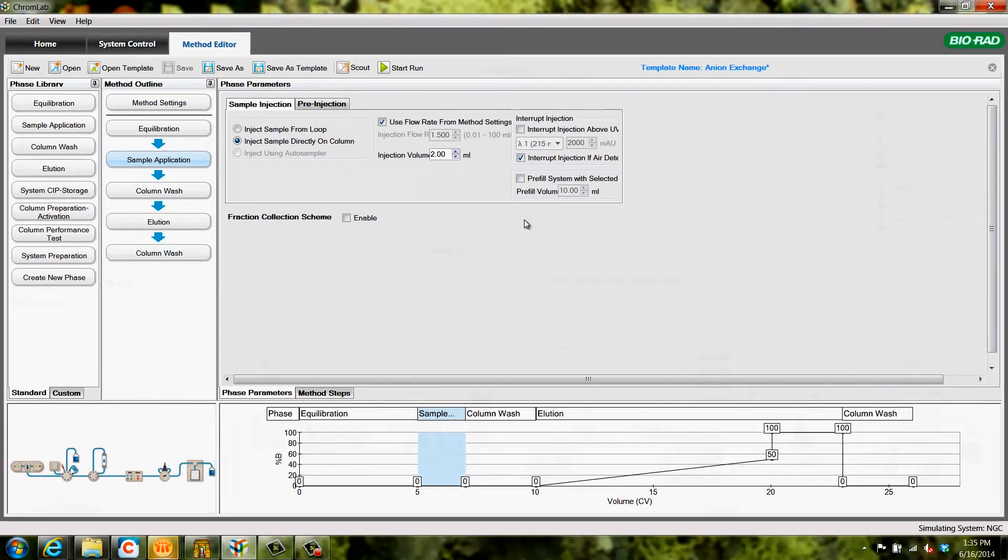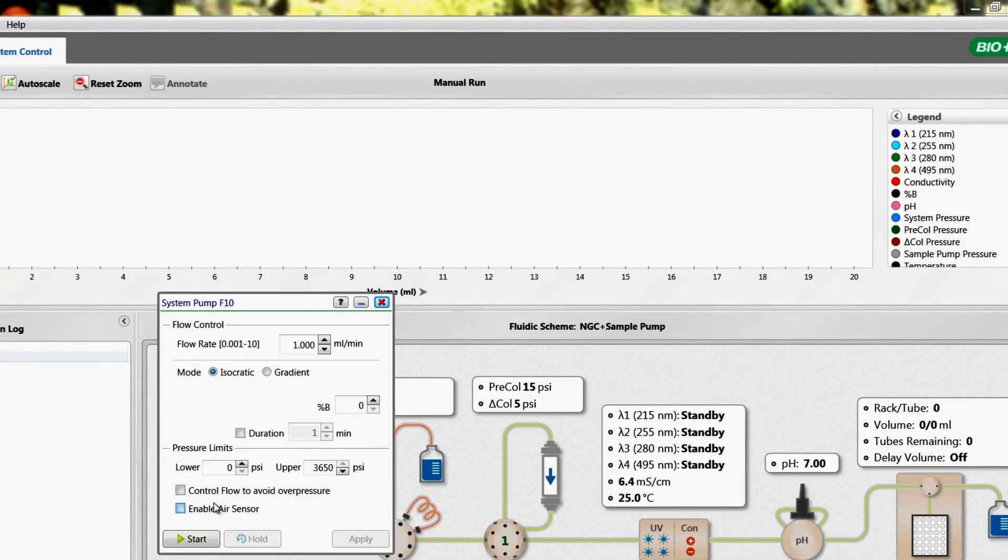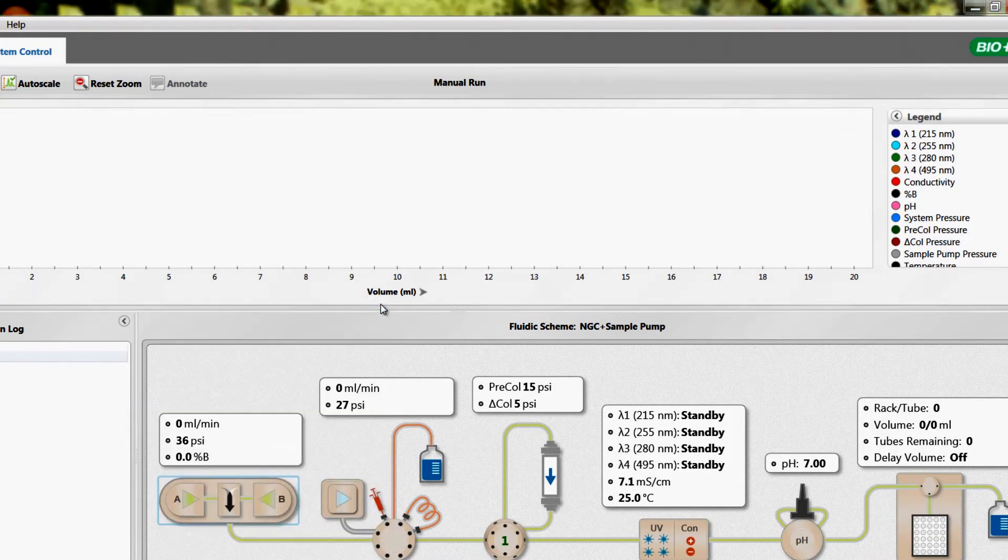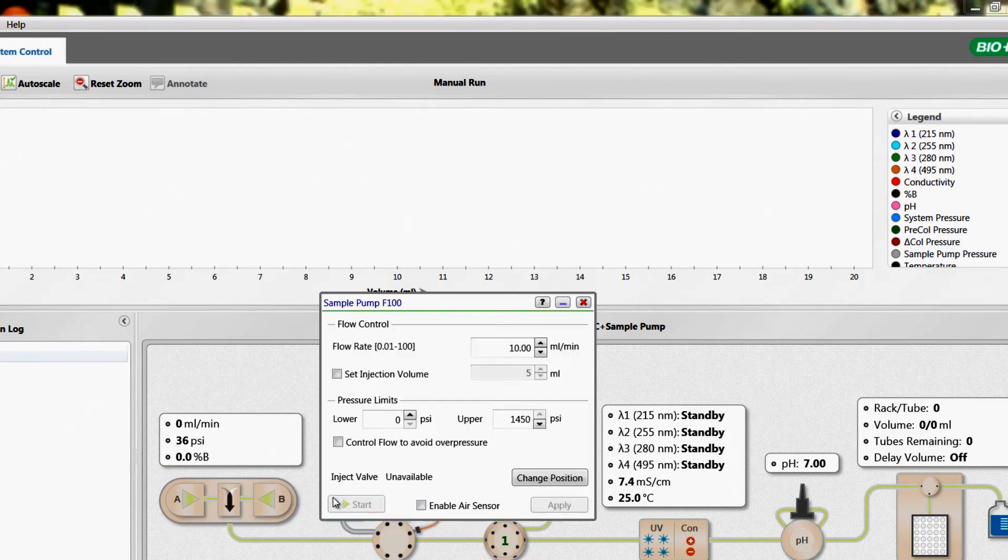If operating in manual mode, make sure the box next to enable air sensor is checked as desired for the system pump and or the sample pump.